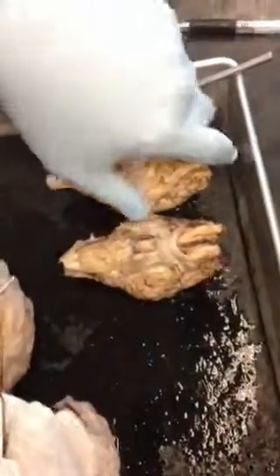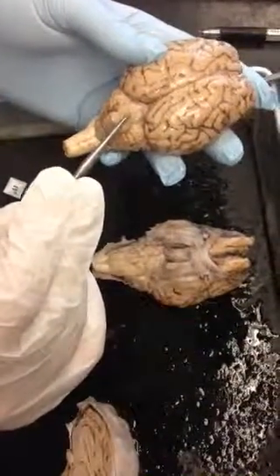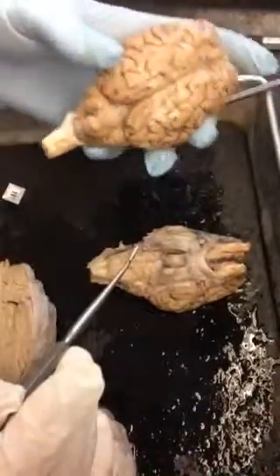Yep. And then of course this is the cerebellum. Yeah, cerebellum.